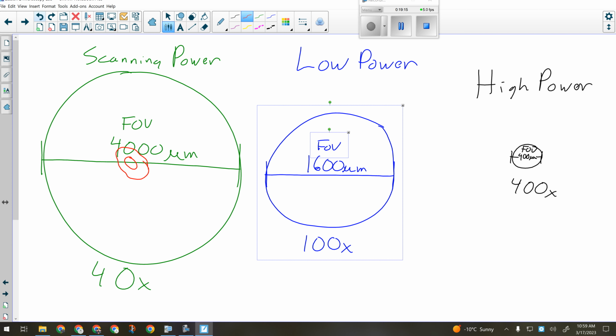They're better, okay? The old microscopes have these knobs here for the stage, and your slide will be inside the little silver part there that you can move around. It's way better because you don't put your fingers on here and push the slide down and make it go out of focus while you're trying to move the slide around. Okay, it's a pain in the neck to use those. So try and get one of the old ones. There should be enough because this is a small class. Okay, so you'll move it around until you get it on the end, or sorry, into the middle.